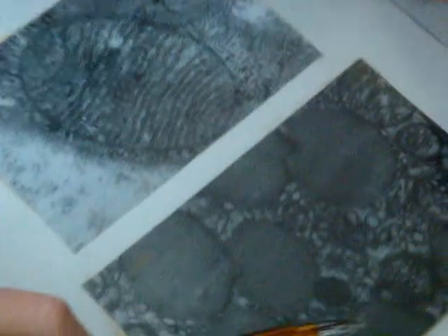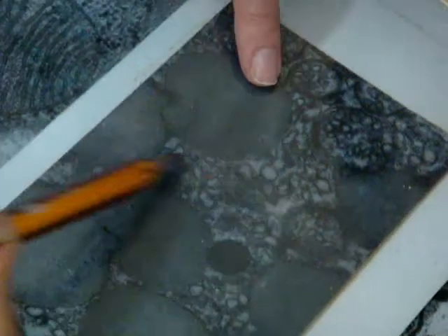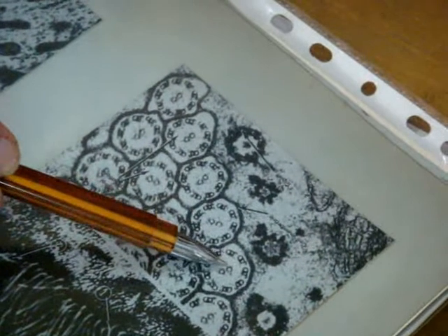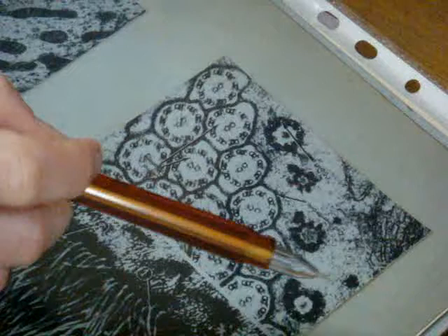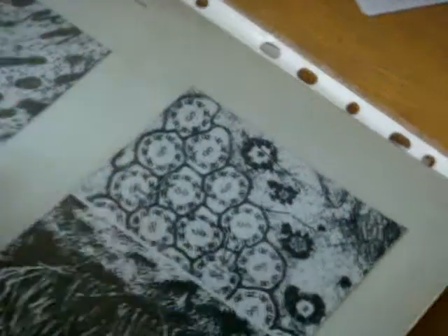This and this synapse. Let's look again at this and this. This again demonstrates for us different types of mitochondria. This is classic mitochondria with flattened type of cristae, this one has tubular vesicle type of cristae, and we can see this lipid droplet, this is adrenal cortex, any cell. This is a specialization of the cell membrane, we can see cilia. This cross-section through the axoneme consists of 9 duplets plus 2 in the center. This basal body through the base has an equal structure to the centriole, 9 triplets. This longitudinal section shows the axoneme and the basal body, to which this corresponds. That's all.